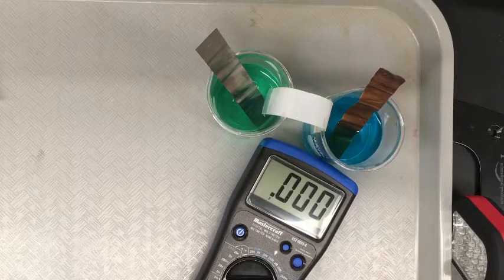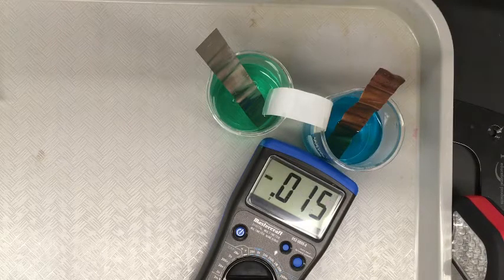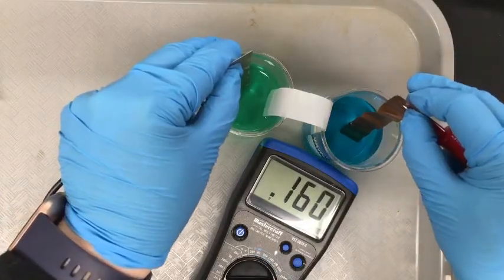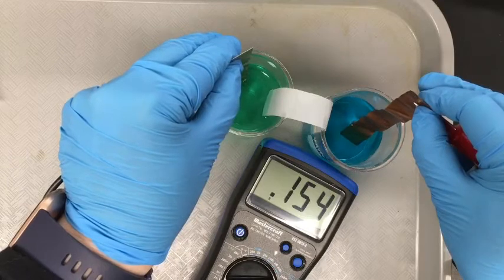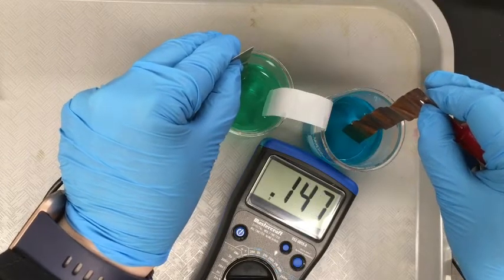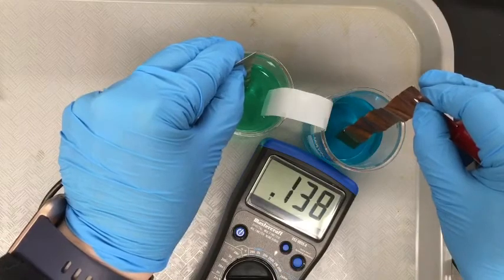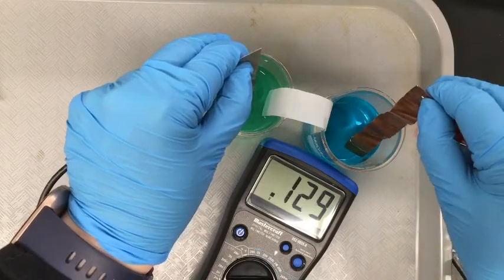So I've substituted the nickel this time instead of the zinc, and now we'll try that again. I've put in a new salt bridge and we'll take a new reading. So hook up the negative to the nickel. Okay, so this one's significantly different. It's 0.15-ish. It's going down a little bit.